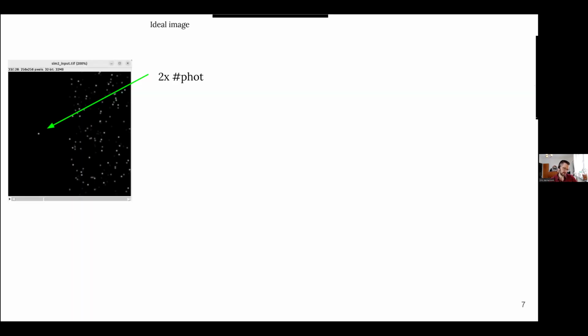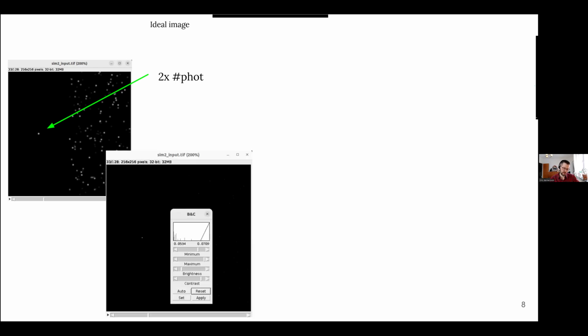And again, I will give a synthetic example. We will have real data later. I made this small image to the left. It's a volumetric image, and you see one slice. In this one, there are several dots, or what you could think of like FISH probes or something similar. One of them is twice as bright as all the other ones, the one I've made this big arrow to. And if you don't believe me, you could adjust the contrast in Fiji, and you will see that it's just that one that is bright.